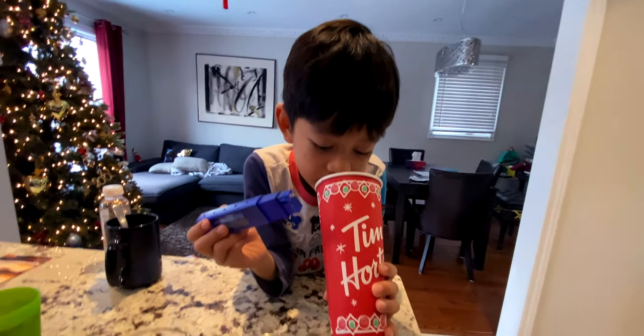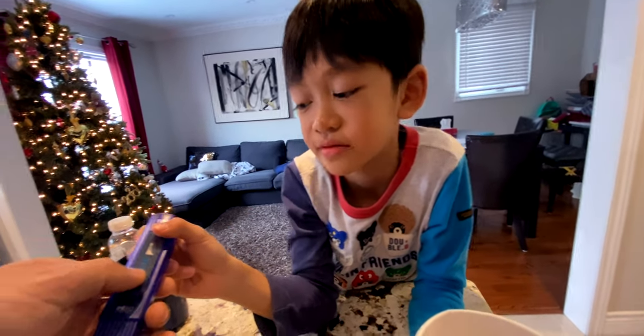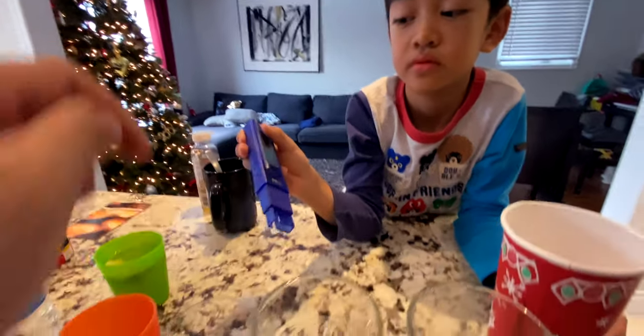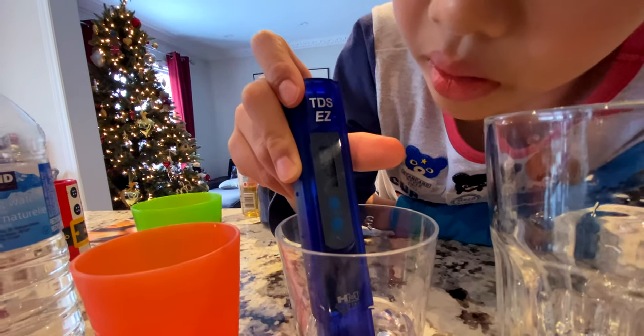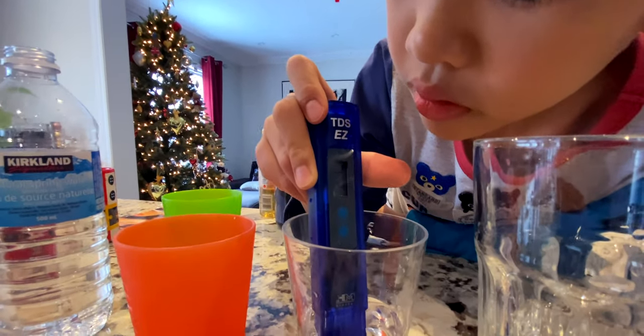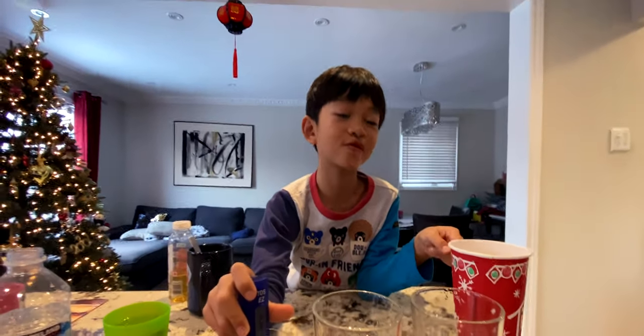Now let's do this one — this is from the water osmosis. What is it? 24. So this water is even better than this. The snow water osmosis reads 24.